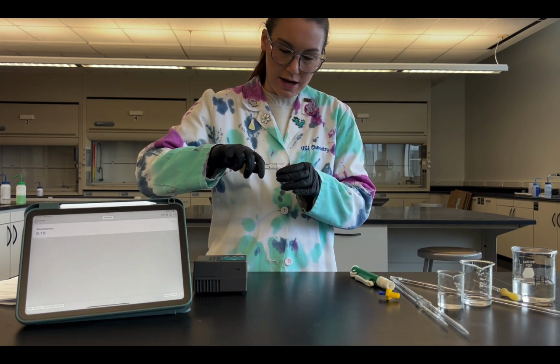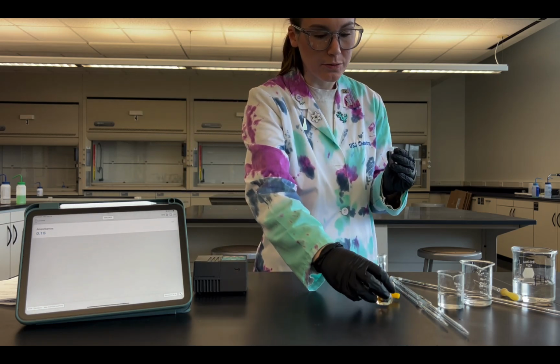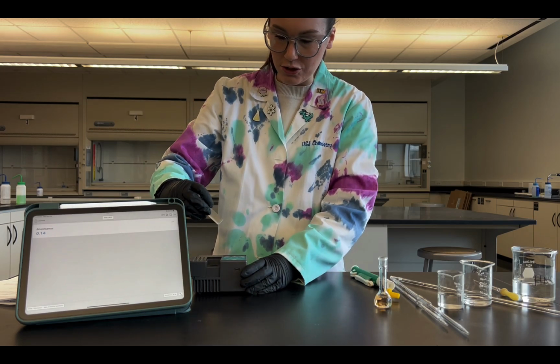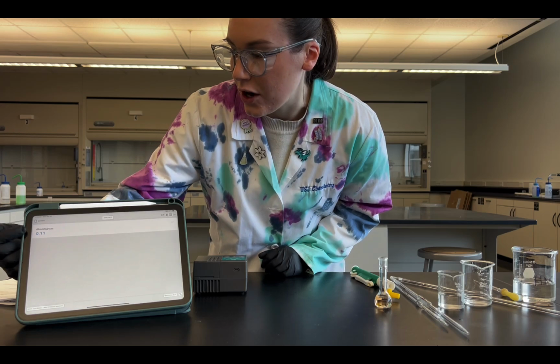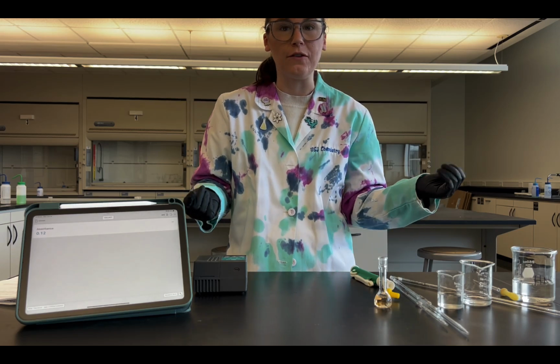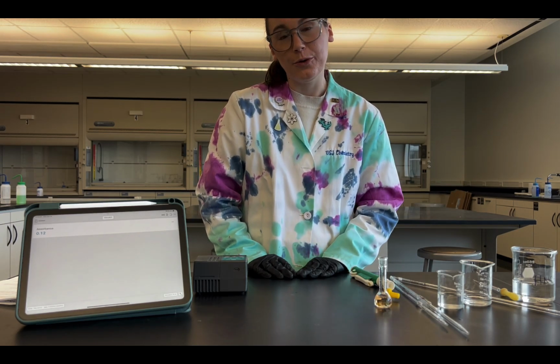So let's go ahead and put this into our cuvette so that we can see the absorbance range of our solutions. Obviously your absorbances are going to be different because they're provided to you in LabFlow if you're taking the lab virtually, but we can see here that our absorbance is now 0.12, which is again in that range of our absorbance curve that we saw in part 1, which is why we're able to use it here in part 2.